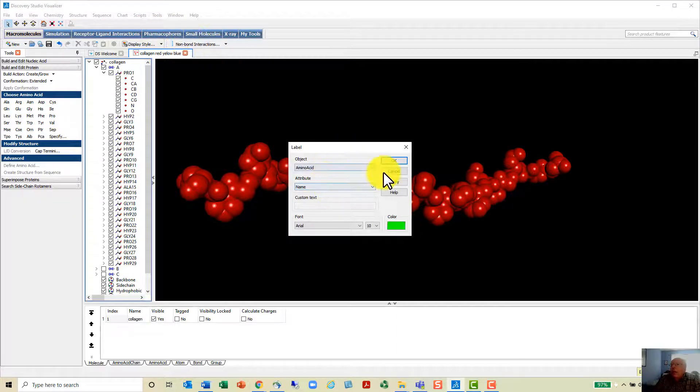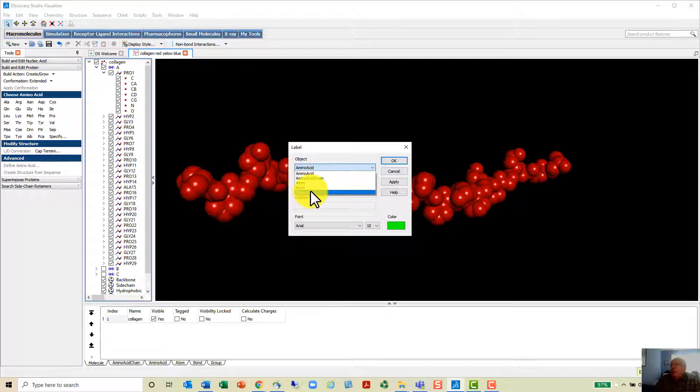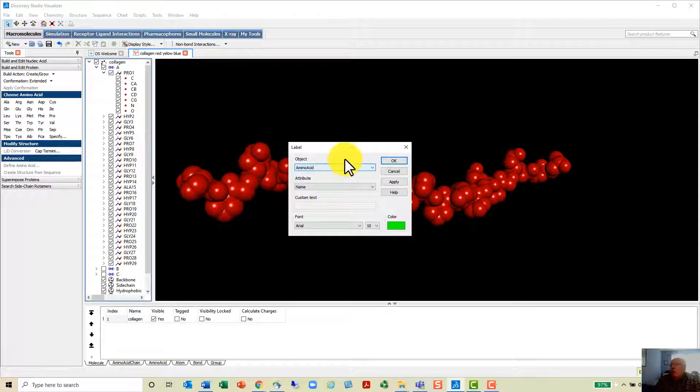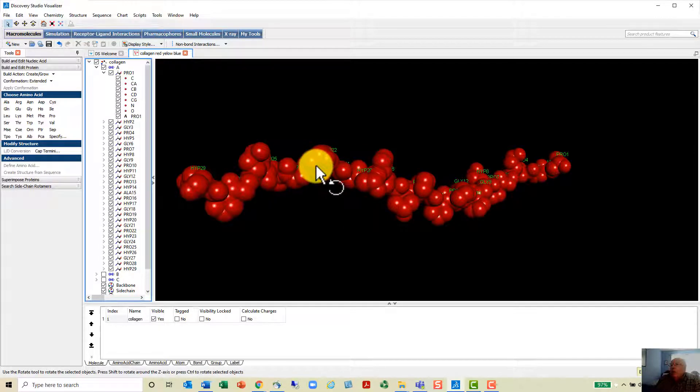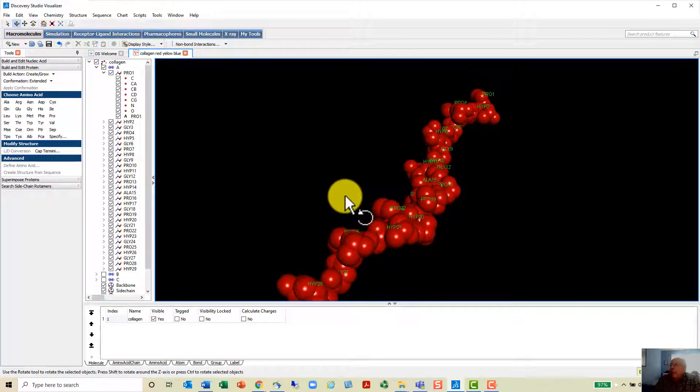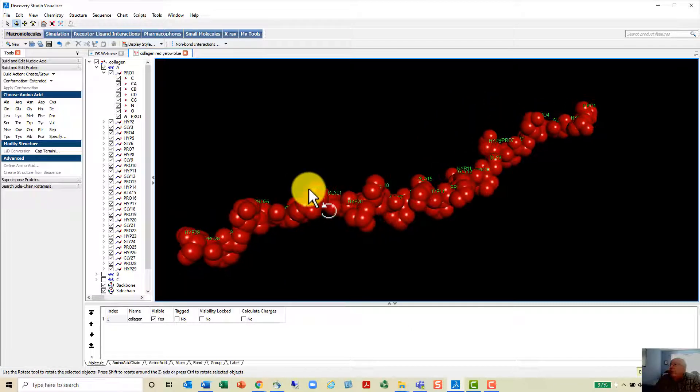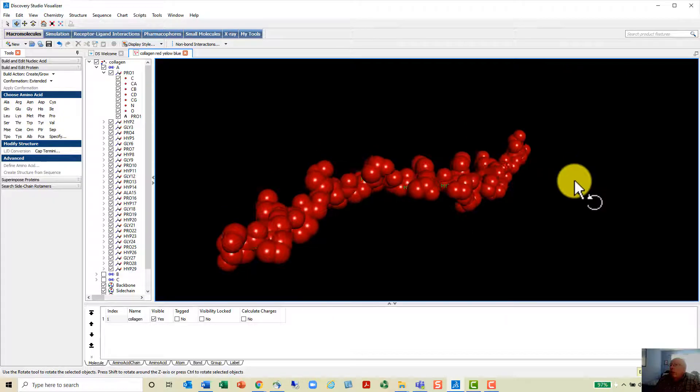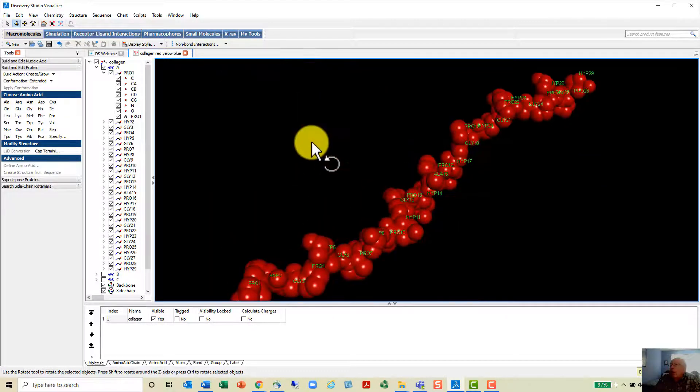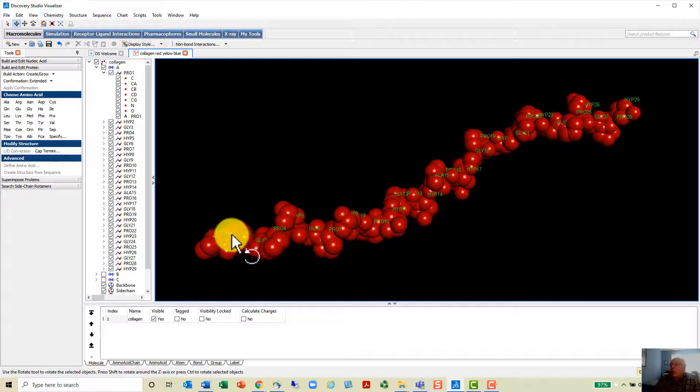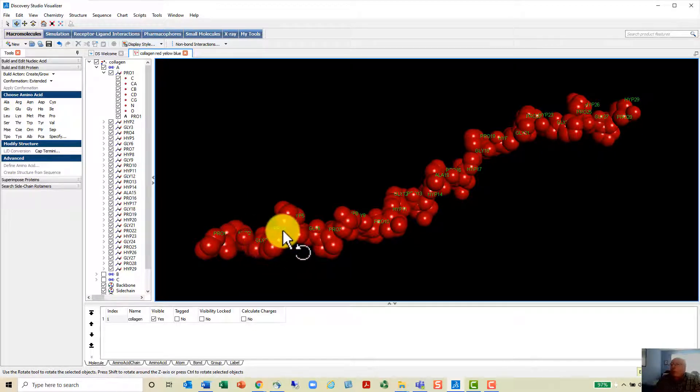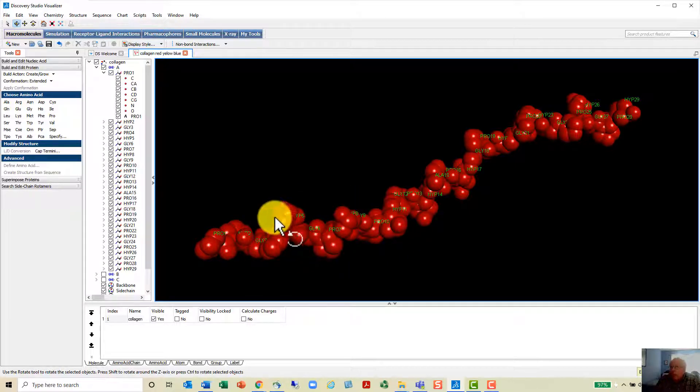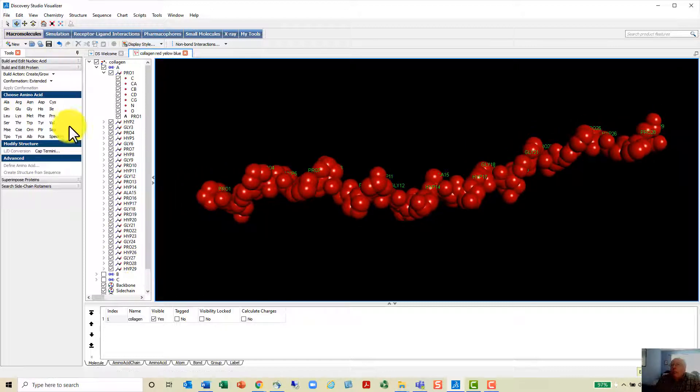You can go into structure and then add labels. You can add the amino acids or even atoms or bonds or various other things, a molecule name if you want to. I've added amino acids. You can see that now we have amino acid names added here. The proline down here at number one is at the other end. There's proline one here at this other end and then there's hydroxyproline and glycine and proline, hydroxyproline, and glycine.